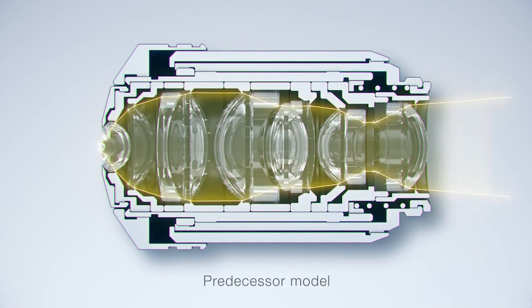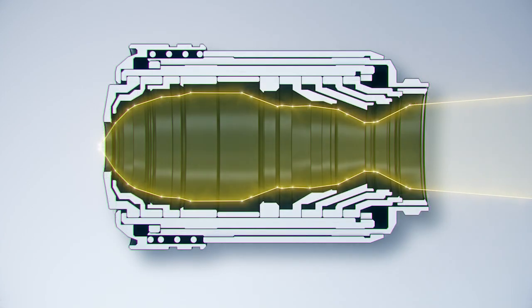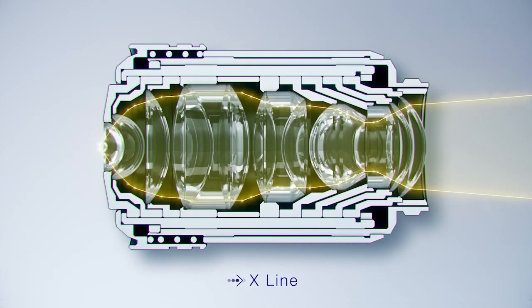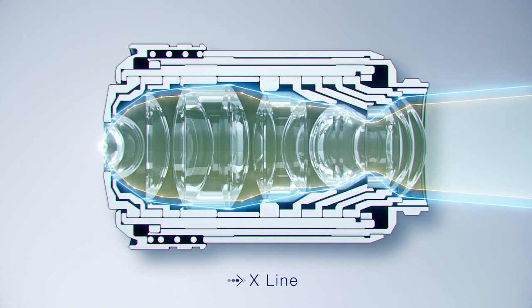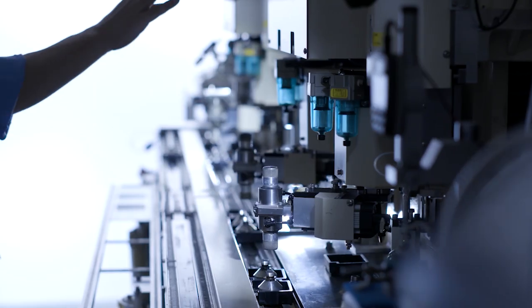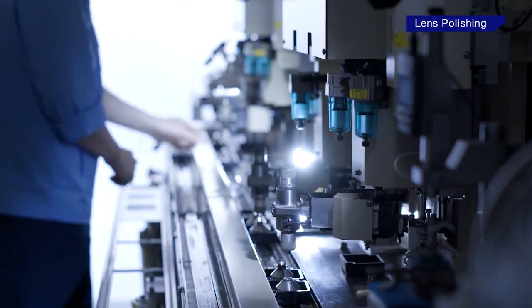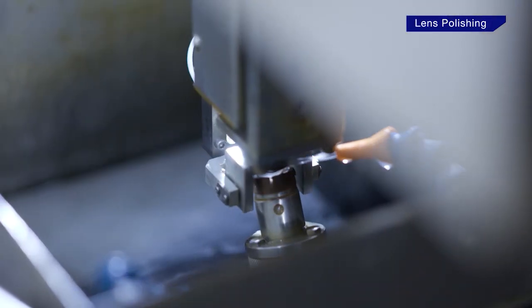The lenses in X-Line objectives are so thin that we can bundle more of them into a standard housing, leading to a dramatic increase in optical performance. To craft these ultra-thin lenses, we invented a new polishing technology.